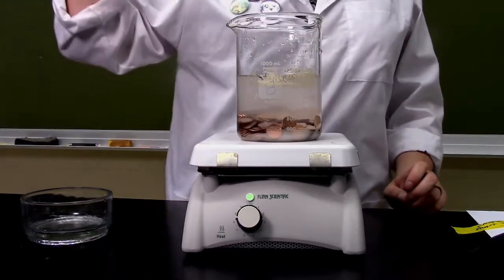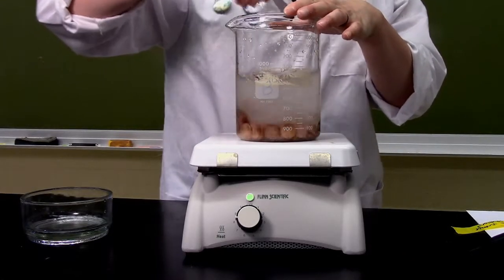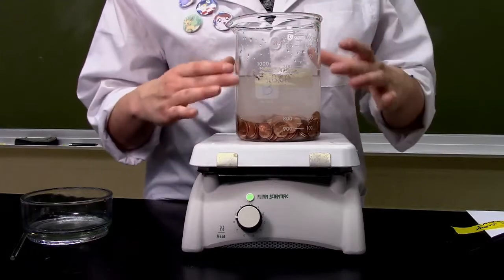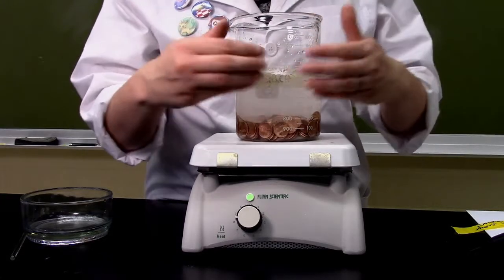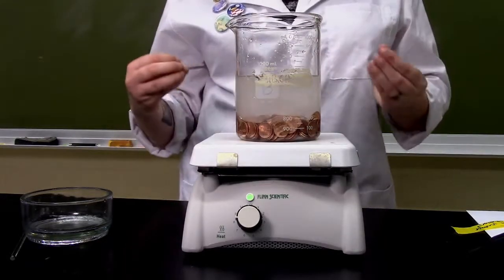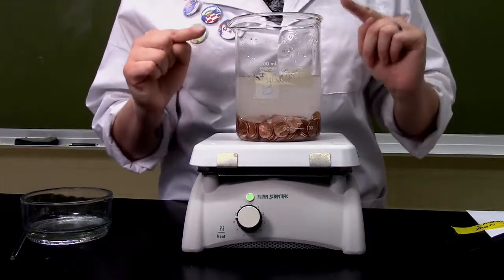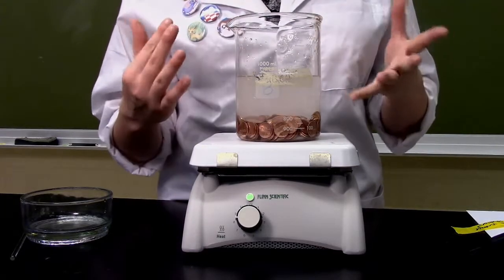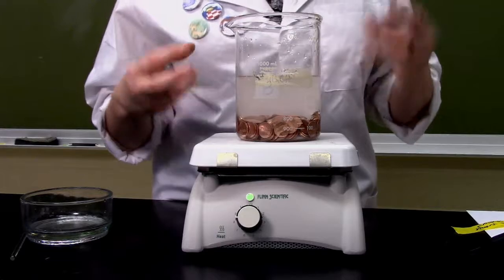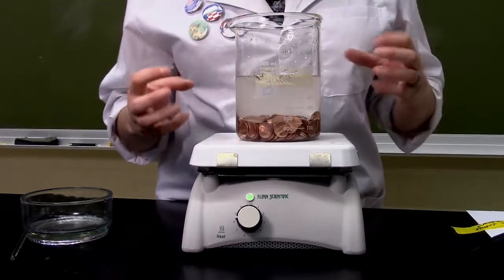I have carefully added my pennies to the vinegar salt solution and stirred it up, and I'm going to wait. I want the solution to be almost boiling, and I'm going to have to stir the pennies every once in a while because there are a lot of pennies, and I want all of the penny surfaces to be exposed to this solution. Notice that I chose a piece of glassware, the beaker, that doesn't get filled all the way to the top. Y'all, you want to choose glassware that is appropriately sized. So if this solution were to start boiling, I know that it physically cannot hop over the edges. I've chosen a piece of glassware that is big enough to contain everything.